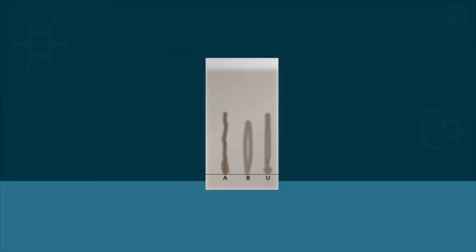Now you can see the difference in migration on the paper. Different samples migrate differently while like samples migrate in an equal way.